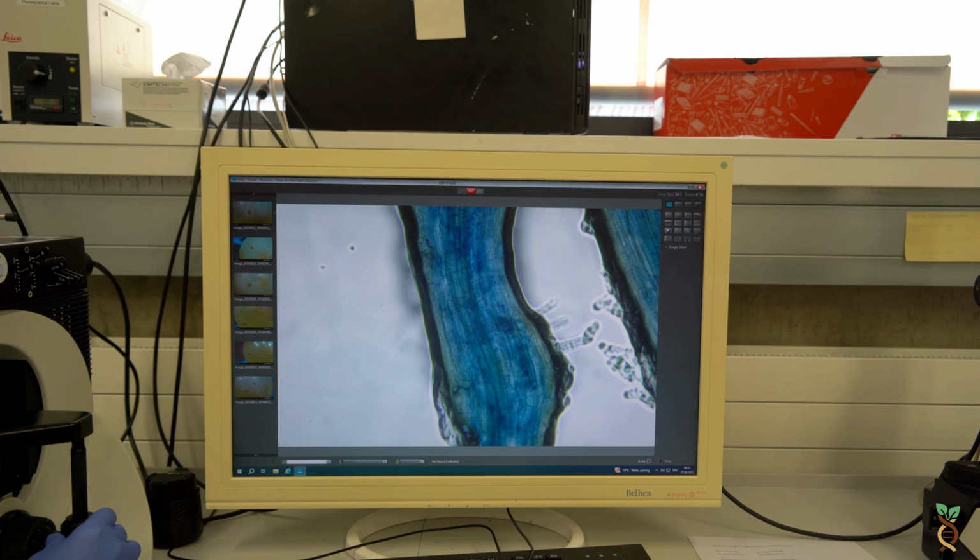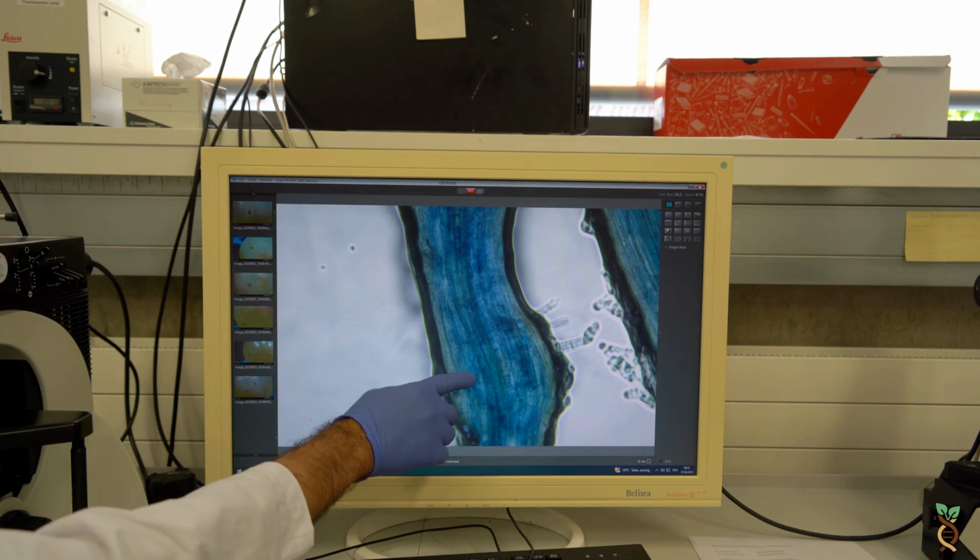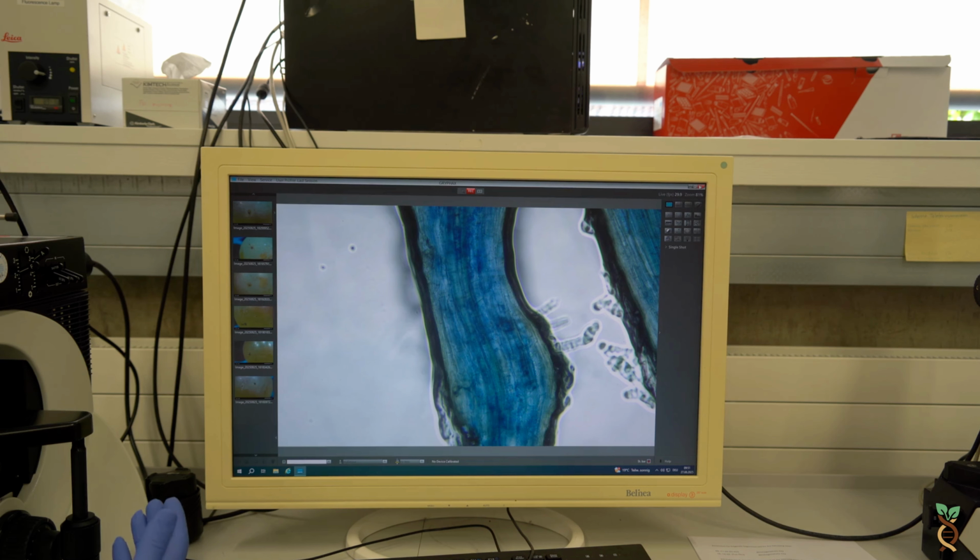By measuring how many of these organisms are present, we can learn to understand how they respond to factors such as agricultural practices, soil conditions, or plant genetics. Until now, quantification of these symbiotic organisms has relied on microscopy, which involves staining the roots and meticulous observation. This is time-consuming and subjective because it depends on the observer's level of expertise.